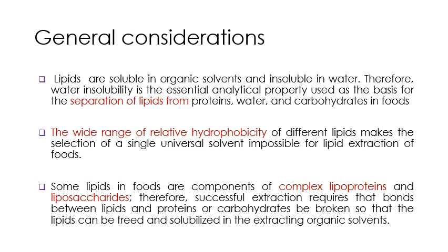Therefore, in order for us to analyze this lipid, we have to successfully extract it by breaking down the bond that is formed between these lipids and proteins or carbohydrates, so that the lipid can be freed and further solubilized in the extracting organic solvent.